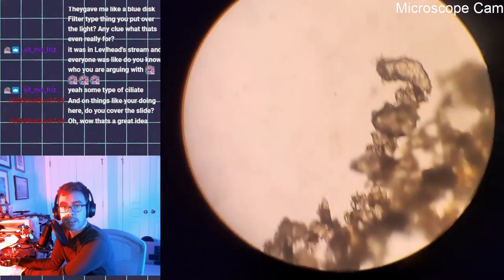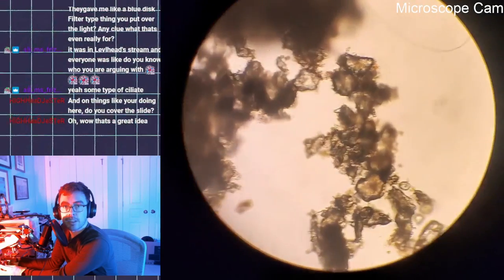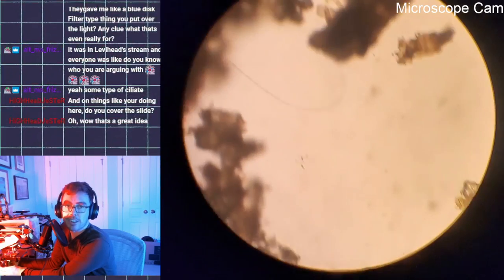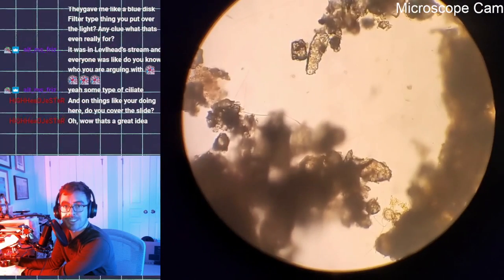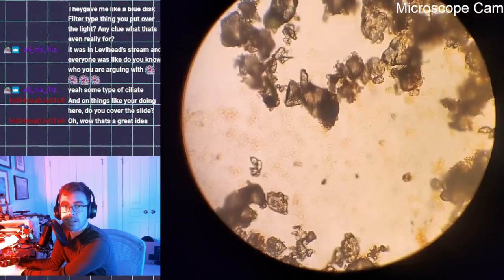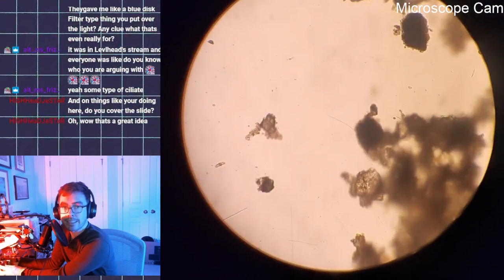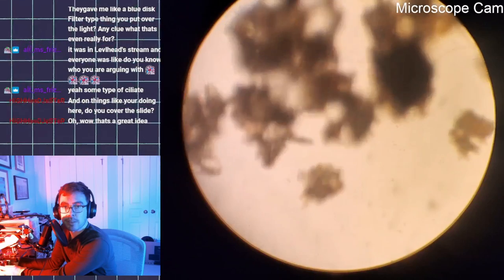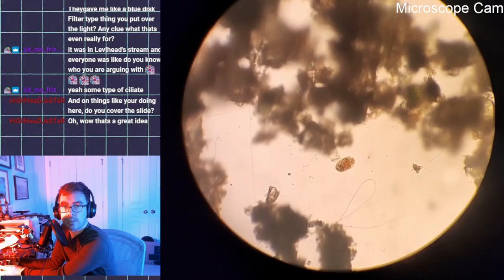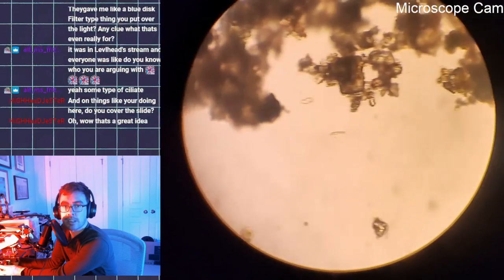Yeah, so really, keep every little bit that you can possibly have. My little area over here is filled with what looks like trash, but they're my microscope tools. Like forceps and an X-Acto knife, Pasteur pipettes, micropipette. I've got my slides, my cover slips, my dishes. Dishes are great too because they double as culturing vessels and as things to put under the microscope directly.